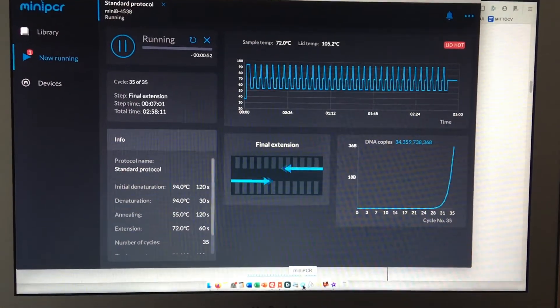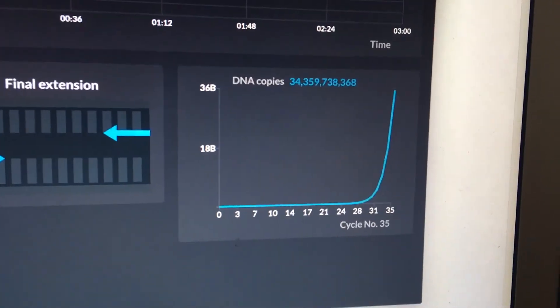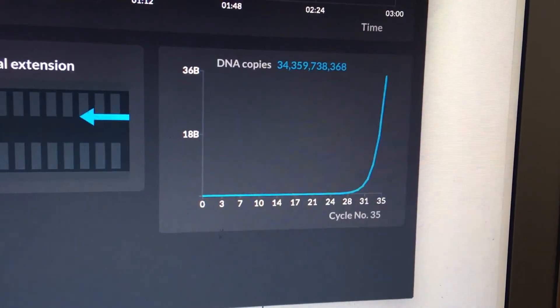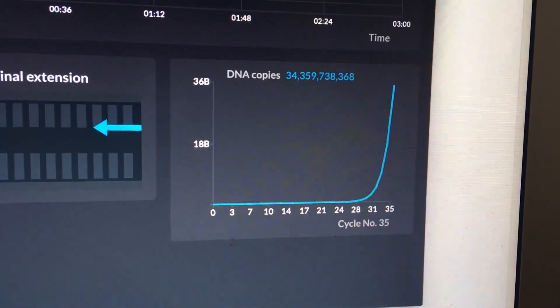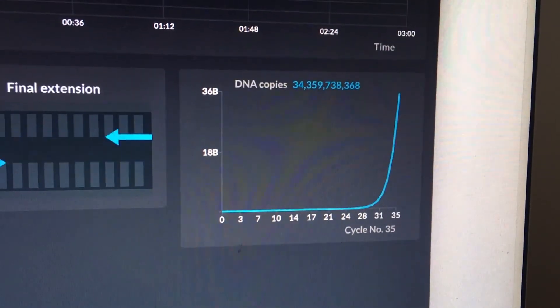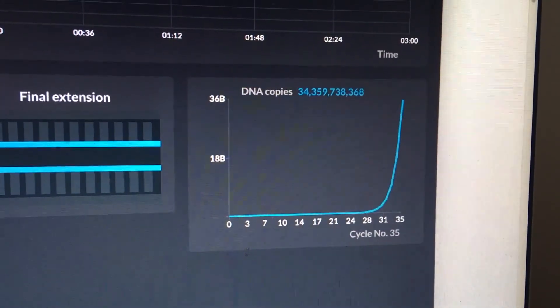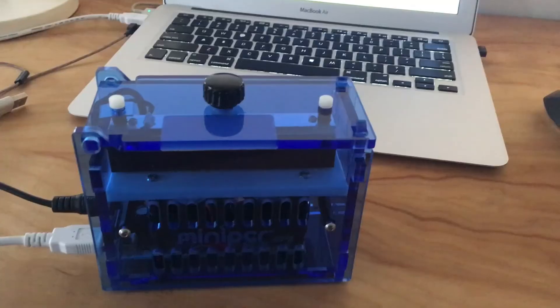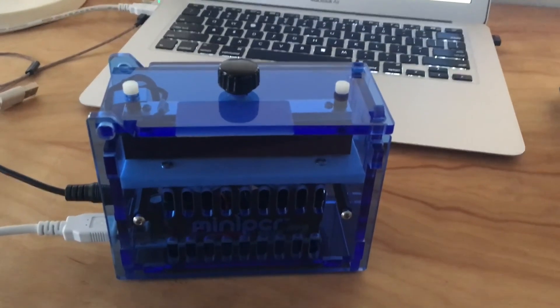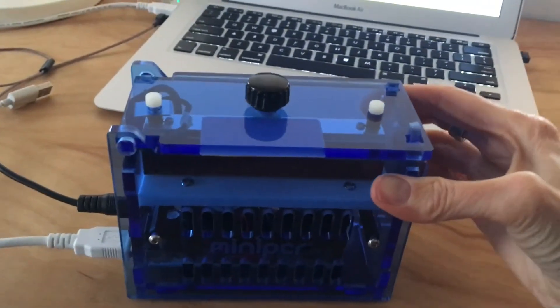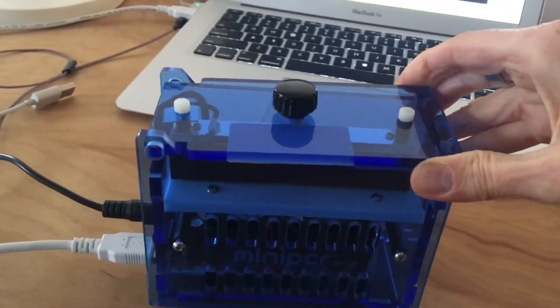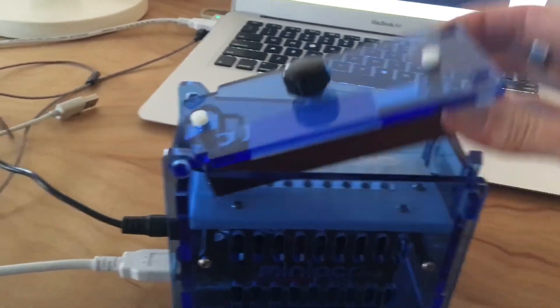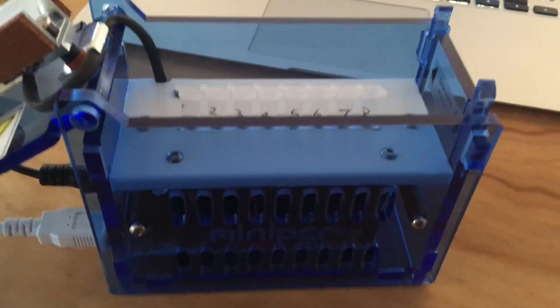So we're nearing the end of the PCR process, and as you can see there in the corner, we've created 34 billion copies of the DNA that we initially went in there with. So that's quite a lot. That's enough for the lab to get us a sequence. And we're done with the polymerase chain reaction, so we can pop the lid, and these are now ready for gel electrophoresis.